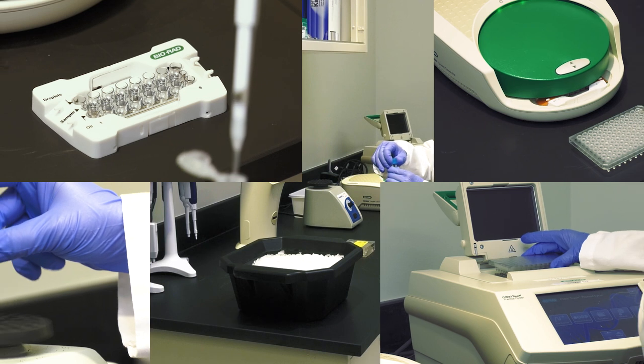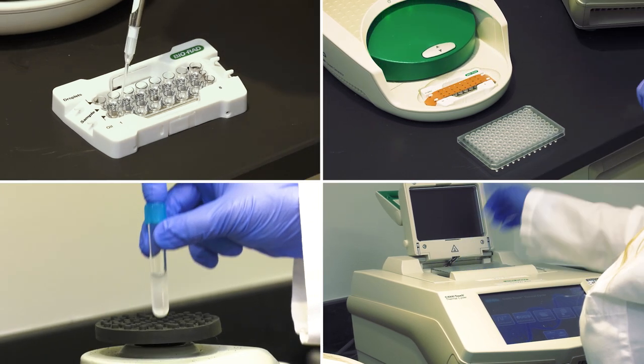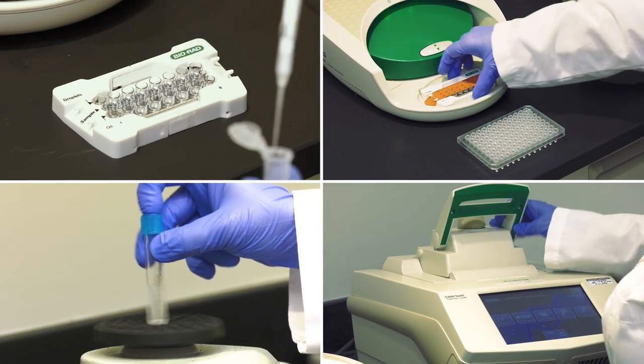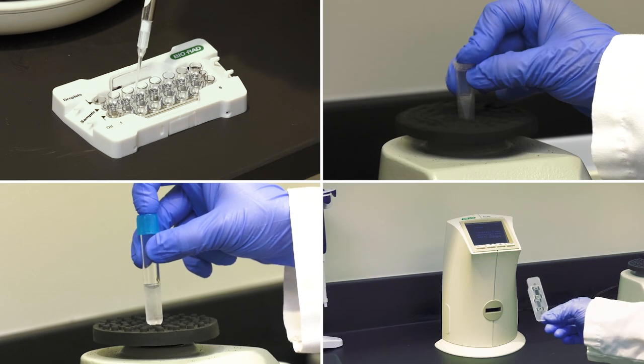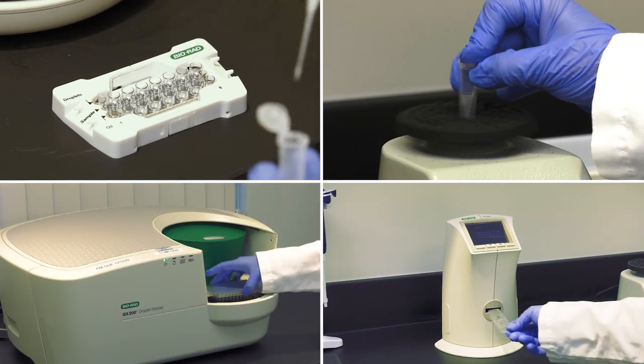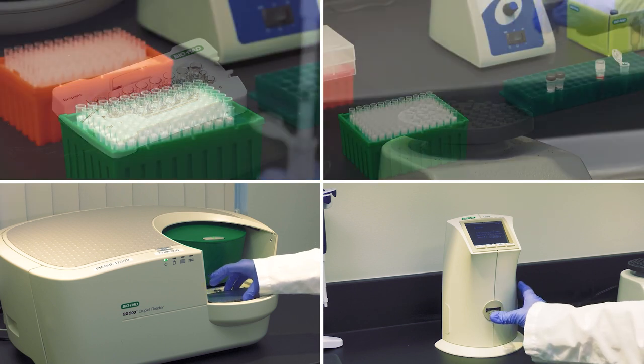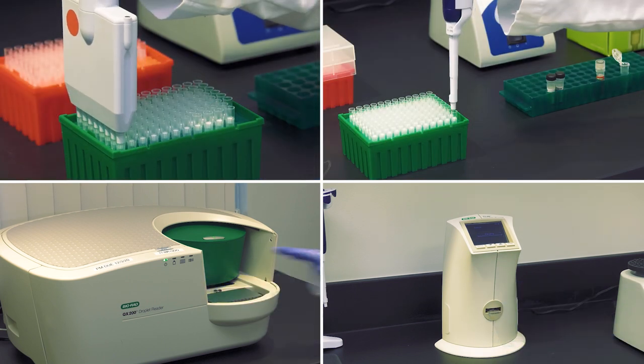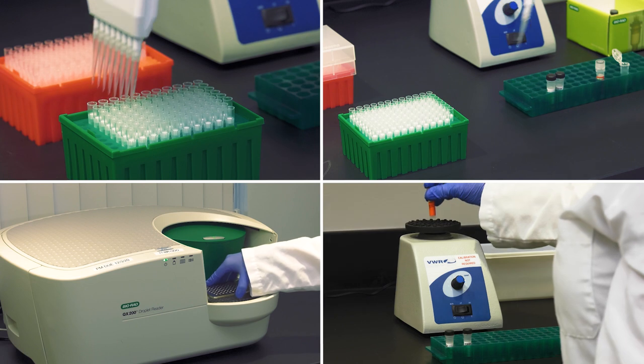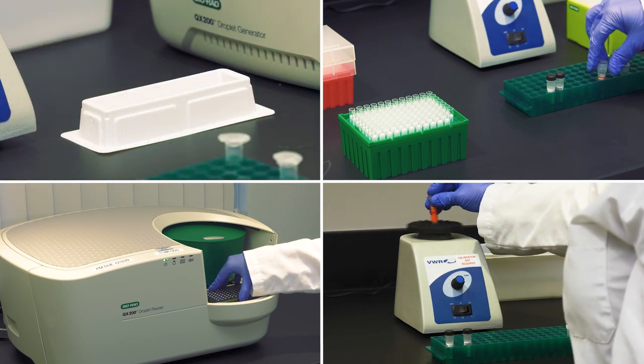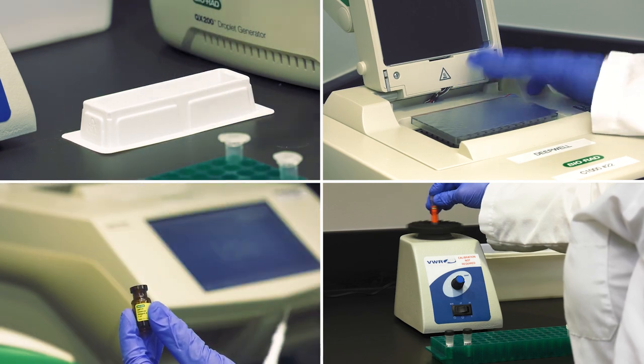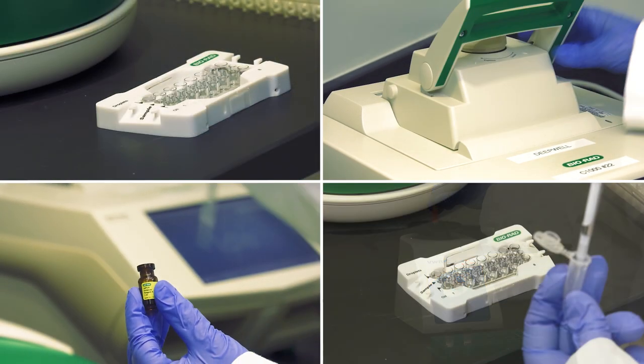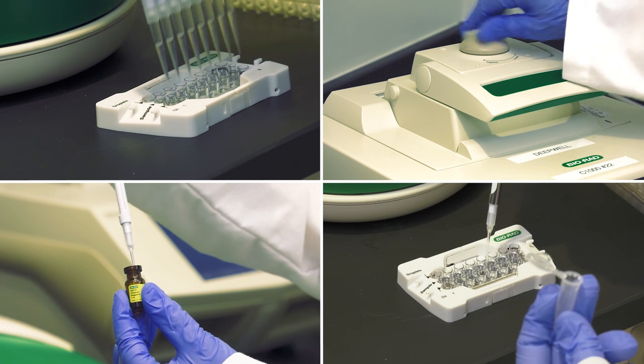In this video, we are excited to review the Droplet Digital PCR or DDPCR whole cell DNA workflow. With this simple workflow, you can accurately quantify the proportion of genetically modified cells in a sample. To do this, intact cells are encapsulated in droplets and used in a standard DDPCR reaction. This workflow can be used for a wide variety of applications, such as monitoring of transgenic CAR-T cells or CRISPR-Cas9 modified cells.